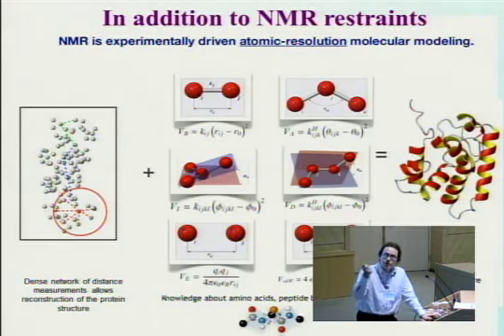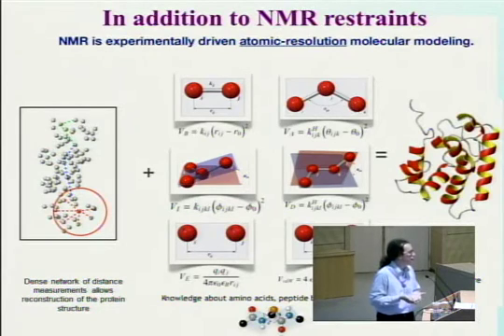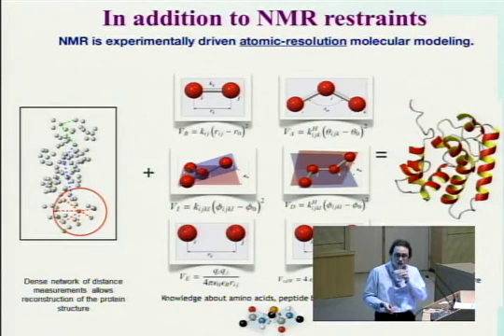Okay, these I already mentioned. You not only use NMR restraints in your NMR structural biology calculations, because you have, as you know, a number of terms that keep a protein together, which is, for example, bonds or bond angles, which NMR actually cannot provide you an insight in, because, for example, bond vibrations are way too fast on the NMR scale, and you are only ever measuring the average that is made from the vibration, and this similar concept applies to the angle.